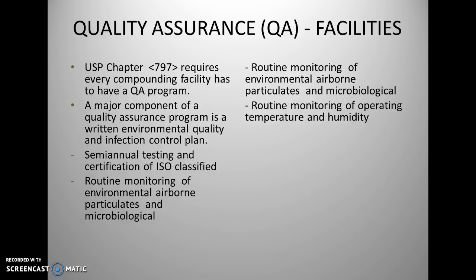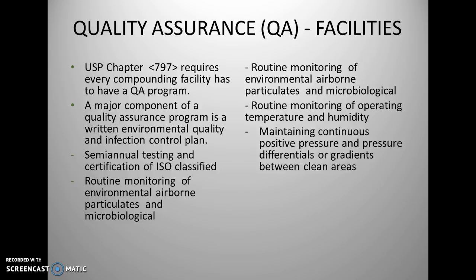There is a maximum growing environment for microorganisms. Many times these particular rooms are relatively cool and have very low humidity, and so there must be an effective way of monitoring the temperature and humidity. Maintaining continuous positive pressures and pressure differentials, or gradients, between clean areas.